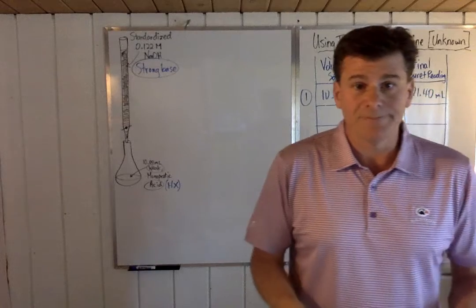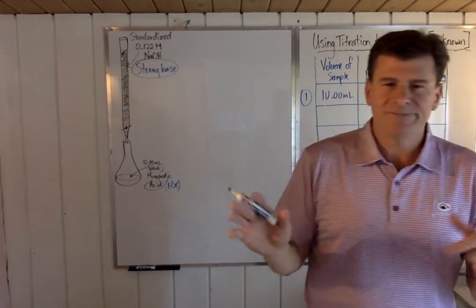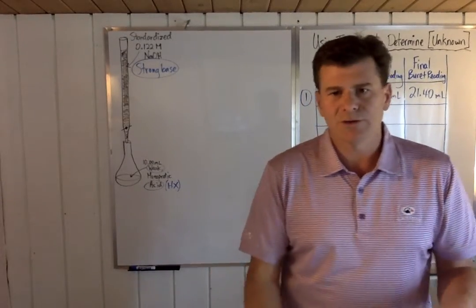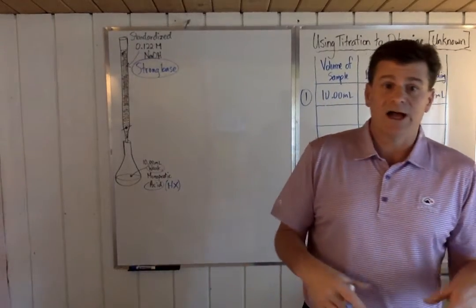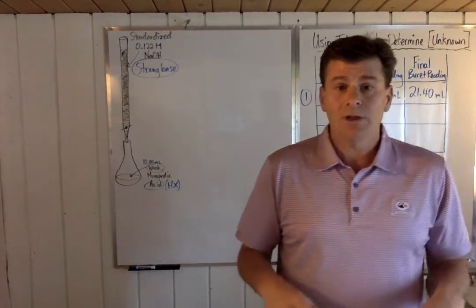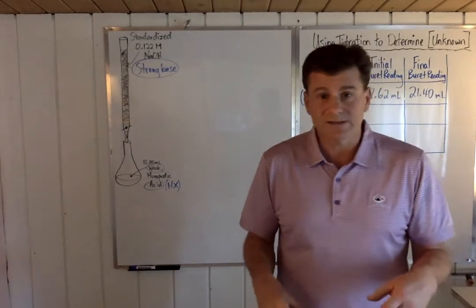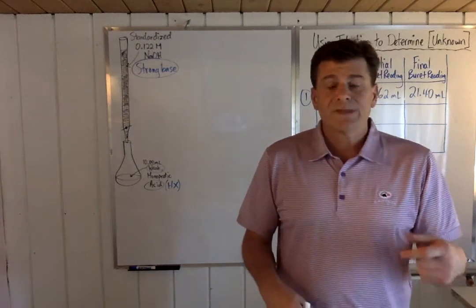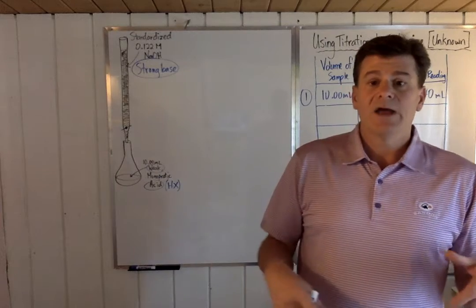Okay, there's trial number one. Now, typically what you're going to do will be different depending on what teacher you have, what lab you're in, and how much solution you have. Your teacher might say, we'll only do one trial because I don't want to waste all the chemical. Chemical's expensive. It doesn't grow on trees for free. It's not like you grab it out of the ground or something like that. So it's expensive stuff, so you don't just waste it.